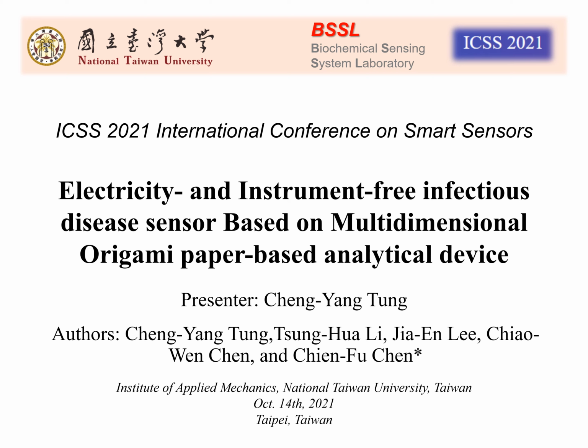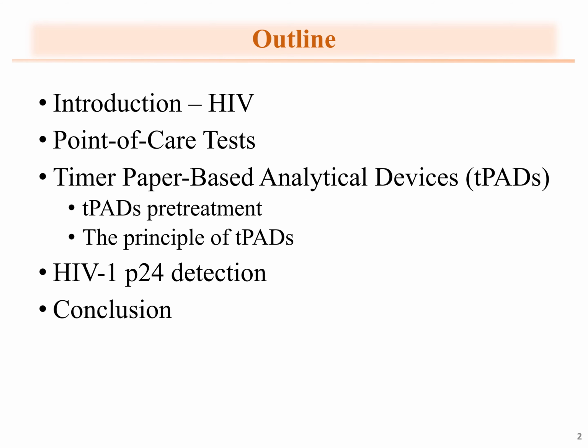My name is Chen Yang Tong, the student from the Institute of Applied Mechanics, National Taiwan University. Today, the topic I want to report is an electricity and instrument-free infectious disease sensor based on a multidimensional origami paper-based analytical device. This is the outline.